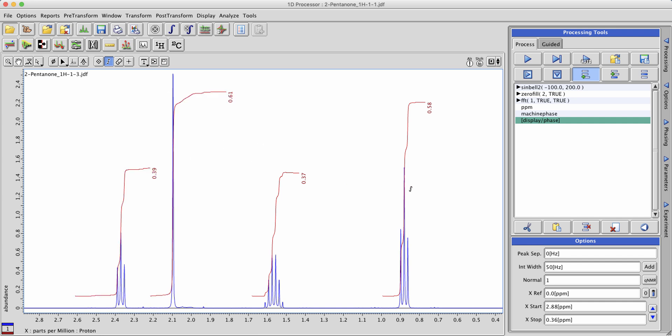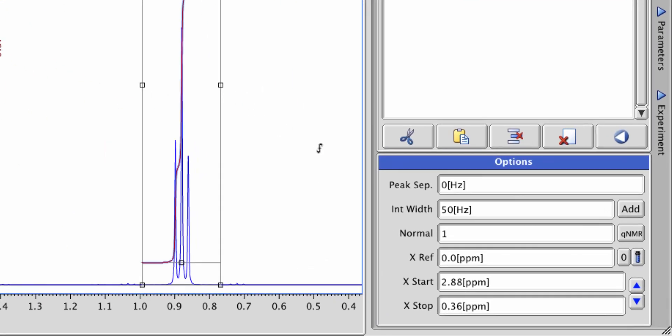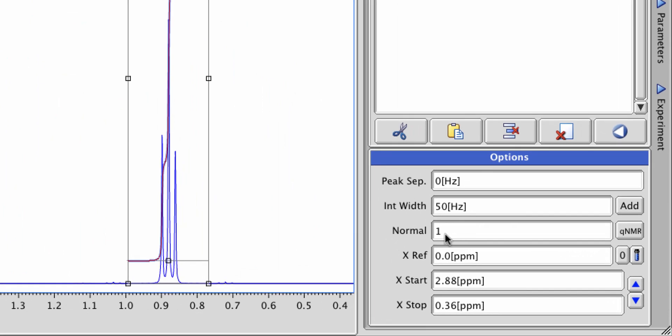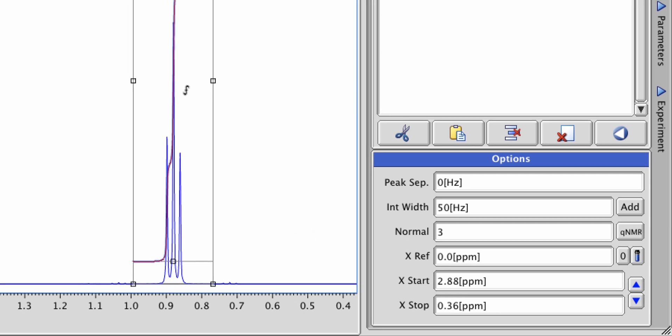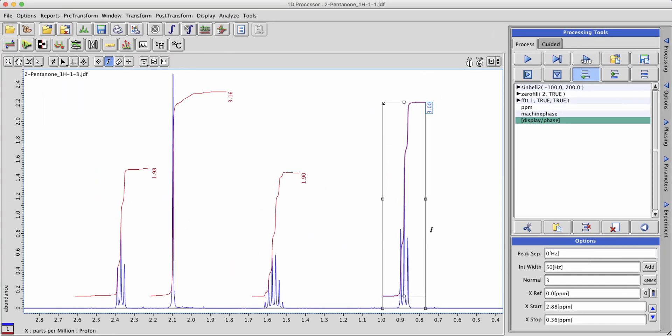Next let's deal with normalization. If you want to normalize a peak to a certain value, select it by left-clicking on it and change the normal value here. In this case I know it's a methyl group so I'll normalize it to a value of three.